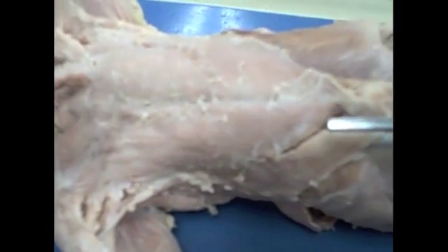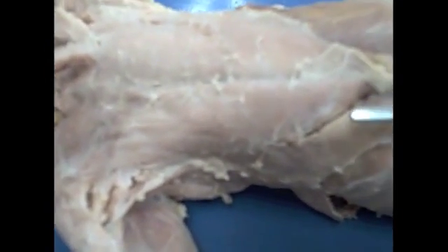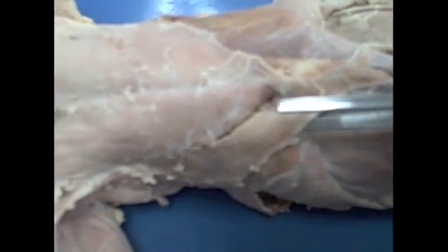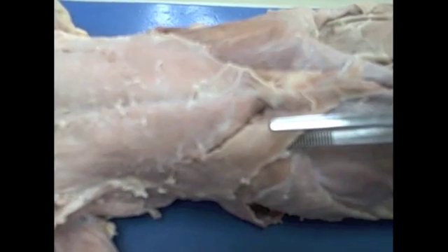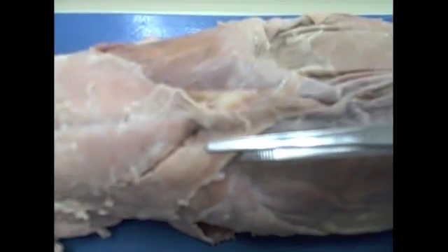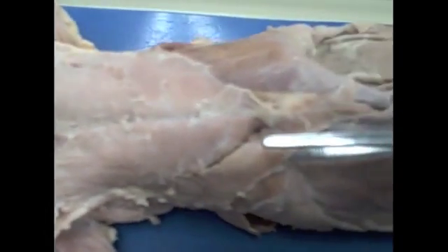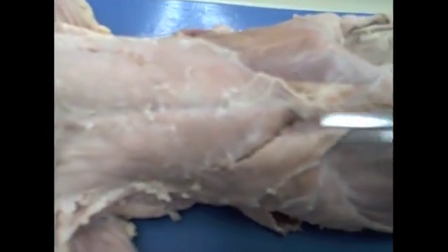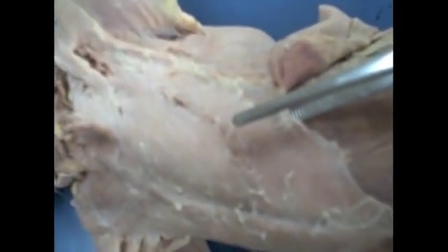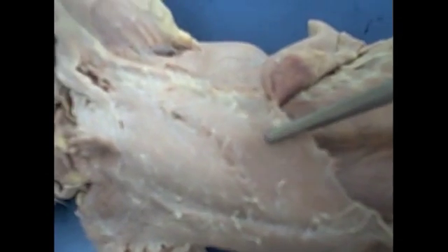First are the pectoral muscles. This is the xiphihumeralis, which originates in the xiphoid process and then inserts in the humerus, and it works in adduction. Next is the pectoralis minor, which originates in the sternum and inserts in the humerus.